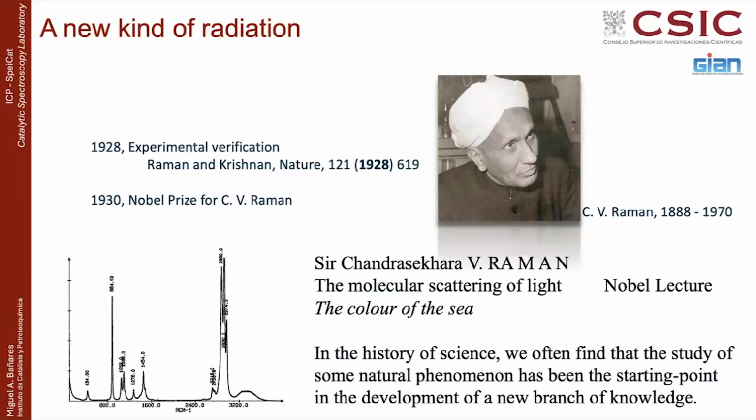Now, this is the Raman spectrum of ethanol, which you can find in a wine, alcohol, or any other drink. And there is an anecdote, I can tell you it's not true, but like they say in Italian, se non è vero è ben trovato. If it is not true, it's well told, because during the ceremony, the king of Sweden was asking Raman to make a toast, but he didn't drink. And then very kindly, he declined, telling the king, Your Majesty, you have seen the Raman effect on ethanol, but I don't think you will be happy to see the ethanol effect on Raman.